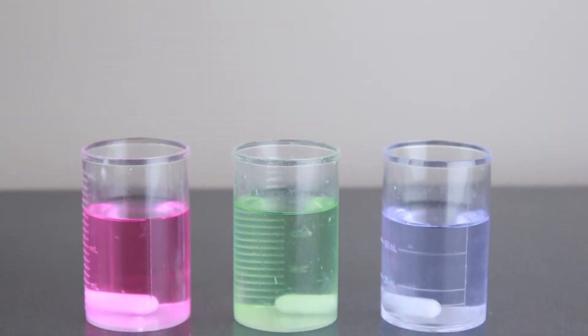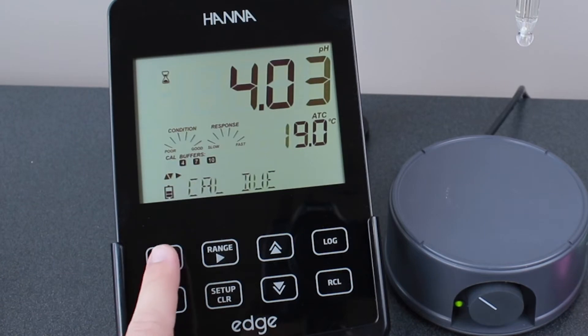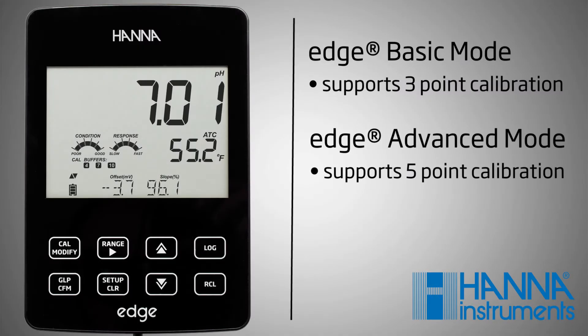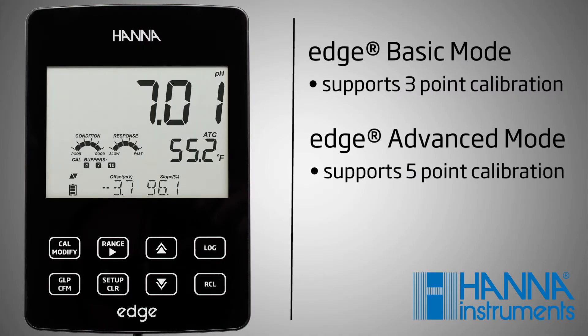To calibrate pH, first be sure your EDGE pH electrode is plugged into the meter and rinse it with deionized water. Pour your HANA buffer into separate beakers and press the CAL button to enter calibration mode. We recommend doing a three-point calibration with the standard 4.01, 7.01, and 10.01 buffers.